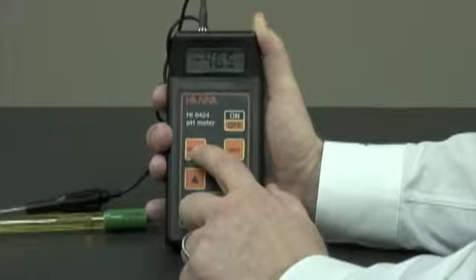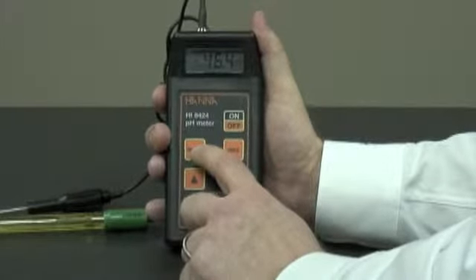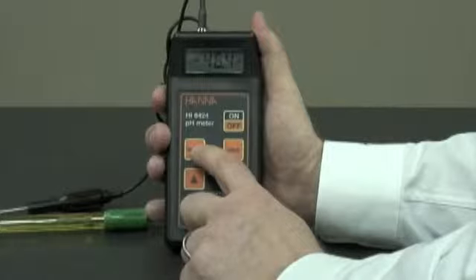In the millivolt range, we can see pH in millivolts, or we could use an ORP electrode.